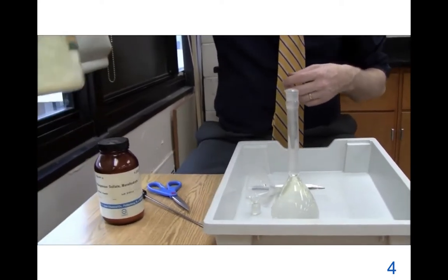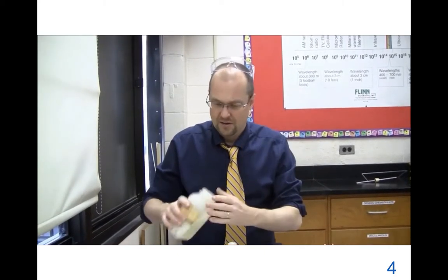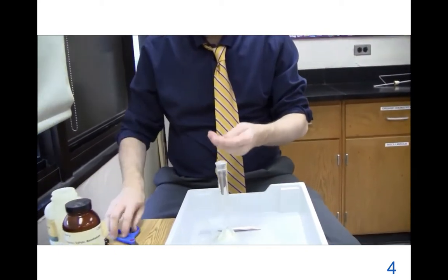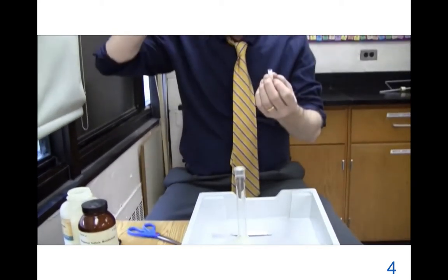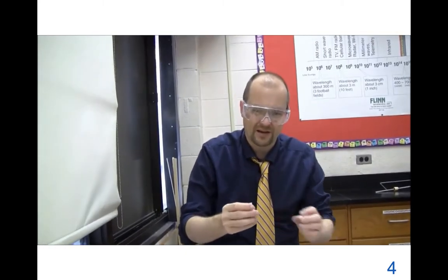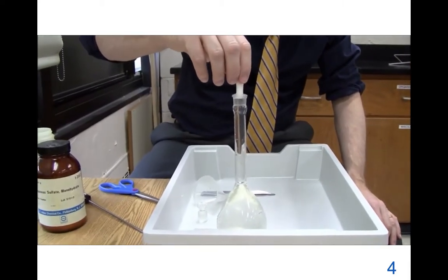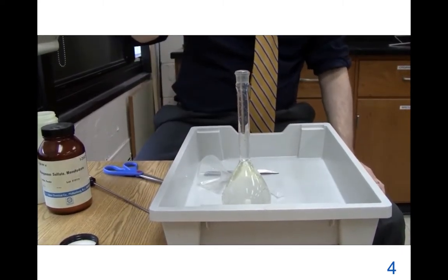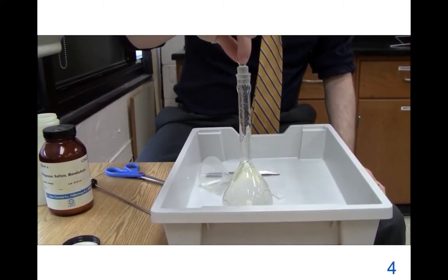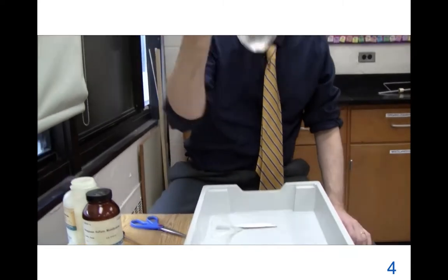And strangely enough, one of these pillows, an alkaline iodide azide pillow. So this supplies iodide and increases the pH because we need those hydroxide ions. Cut that off. Goggles on. Okay, a bit of a second too late. Let's try and pour that in as well. That looks weird. Cork it up, making sure there's no air bubbles. And shake it, baby.